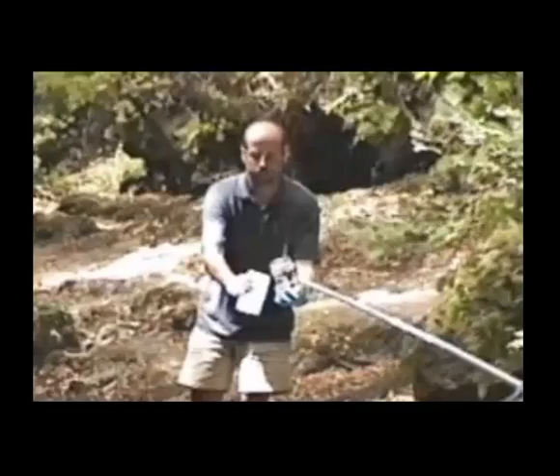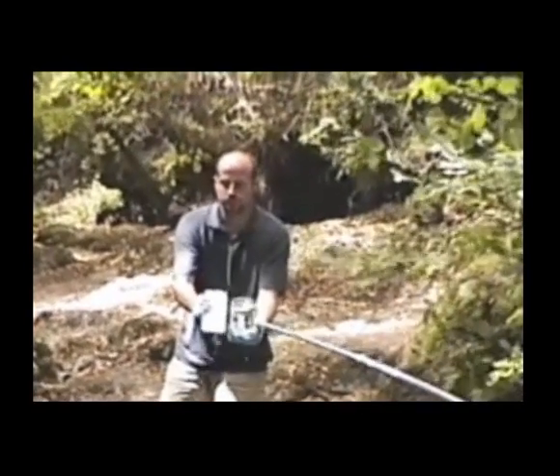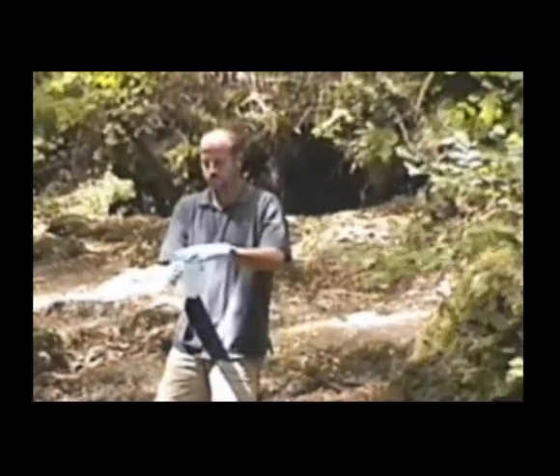The sample container is refilled, and so that concludes our demonstration.